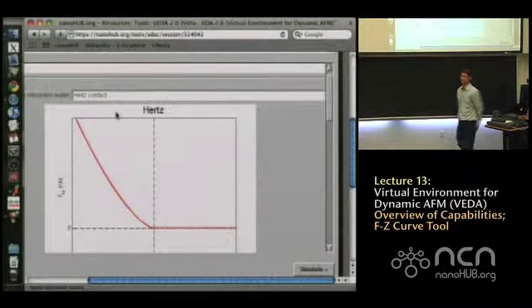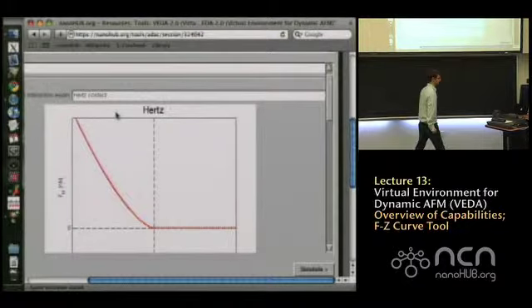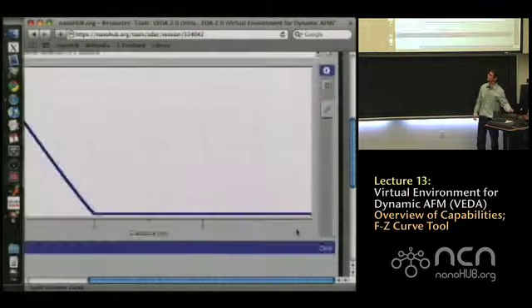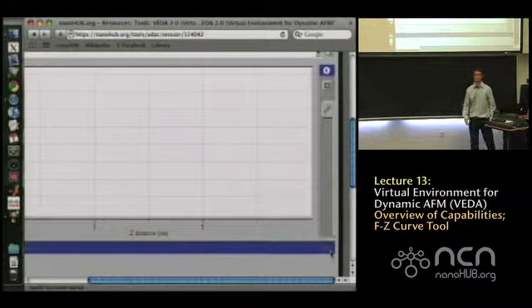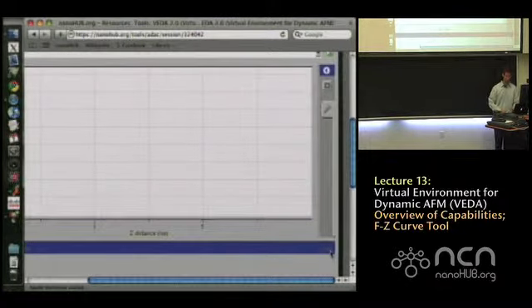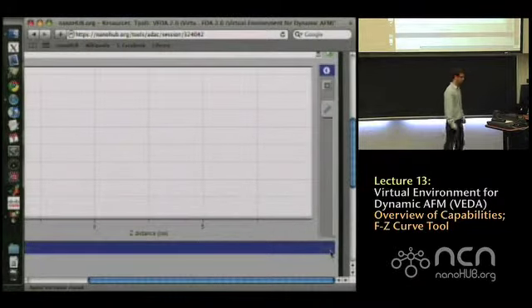Somehow we got to clear everything you already. Oh, and I should mention that after you run a certain number of simulations, if you're transitioning to a new simulation or a new set of simulations, you want to clear out the old ones if you haven't saved them. Down at this bottom corner on the simulations tab, there's an option to clear the data. Occasionally you want to do that, just if you're changing too many parameters, it gets complicated in terms of the display.